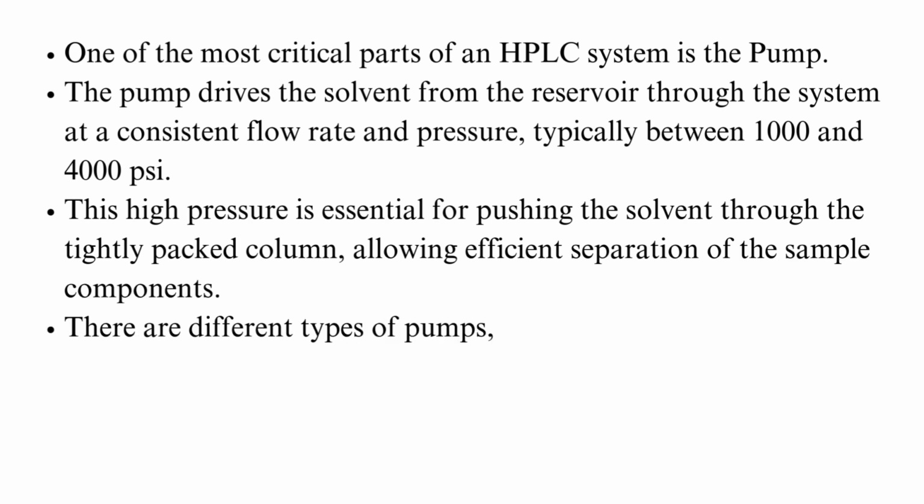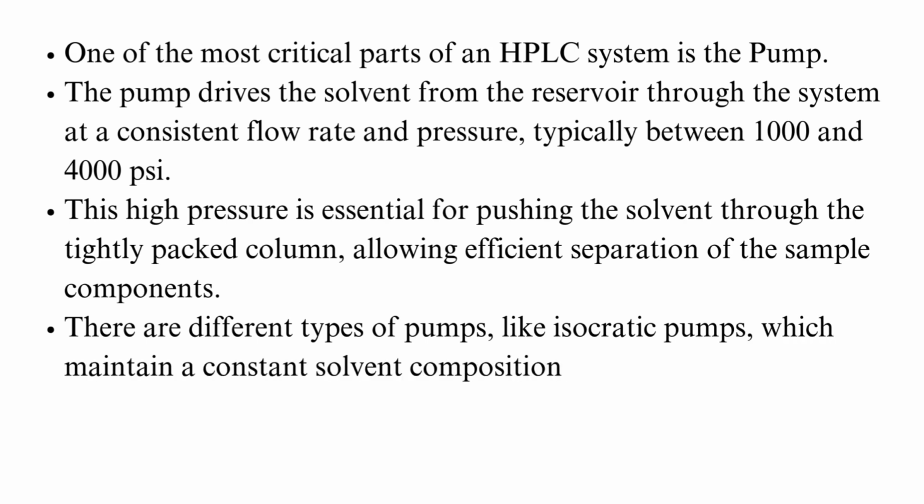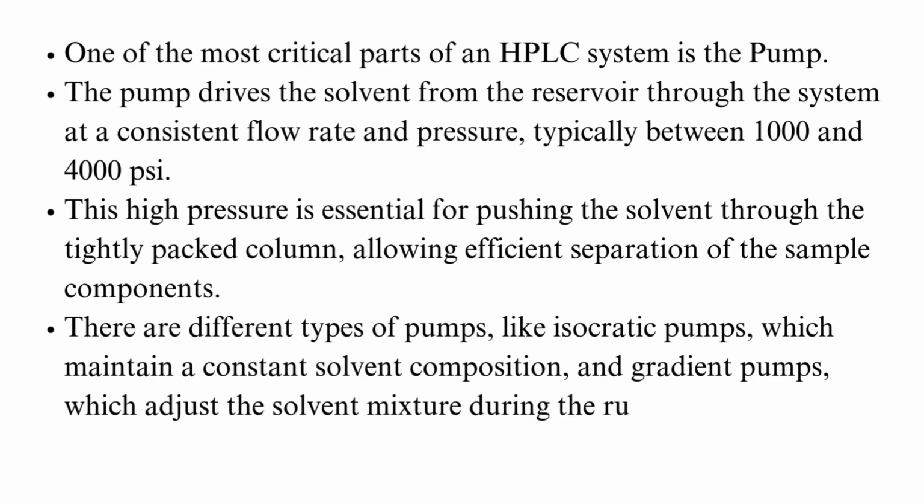There are different types of pumps, like isocratic pumps, which maintain a constant solvent composition, and gradient pumps, which adjust the solvent mixture during the run for better separation.